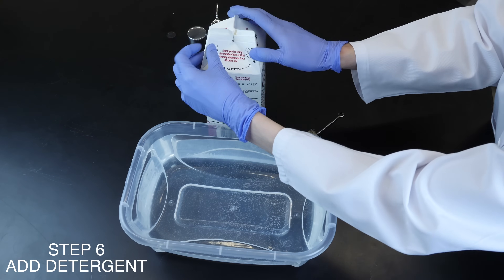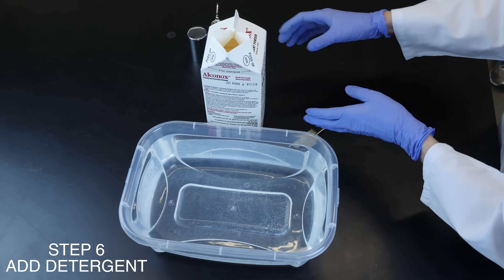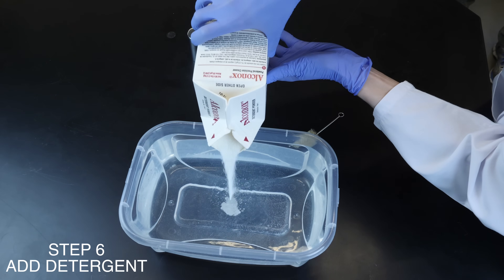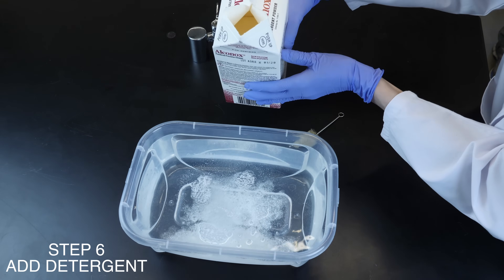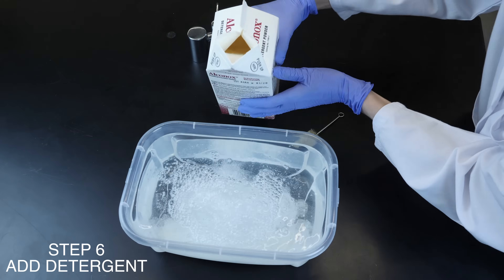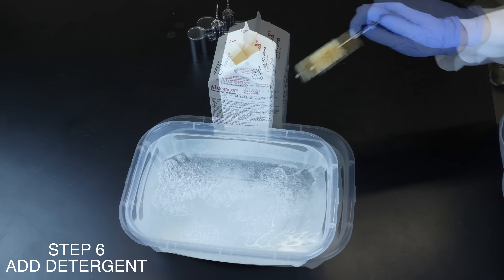Start by pre-soaking. For most oil, protein, and organic residues, use an alkaline cleaner. For most inorganic salts, complexes, amphoteric, starches, and many amines, use an acid cleaner. Use low-foaming detergents for high-agitation automated washers.